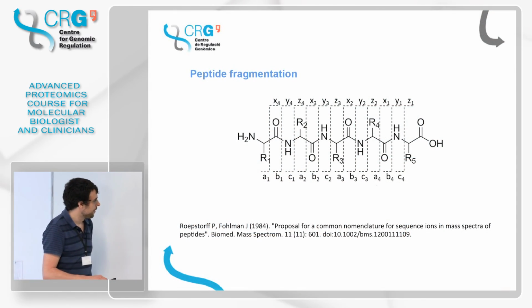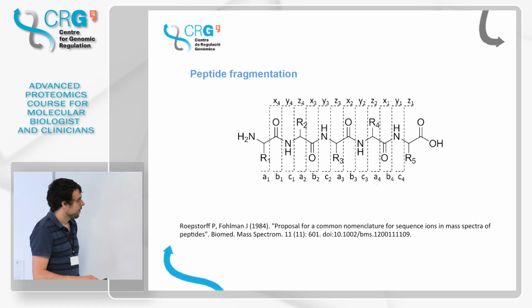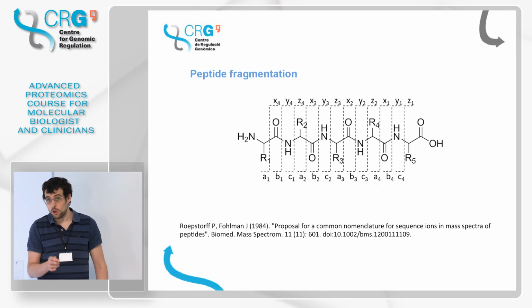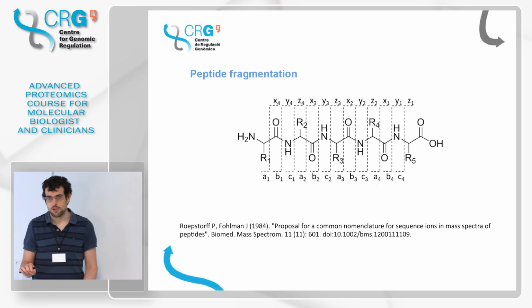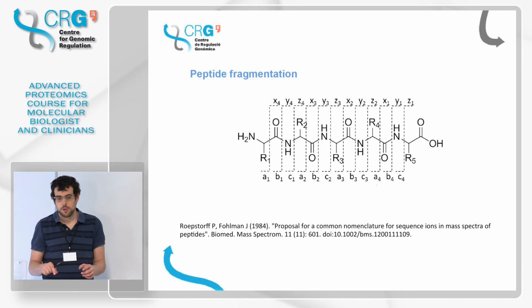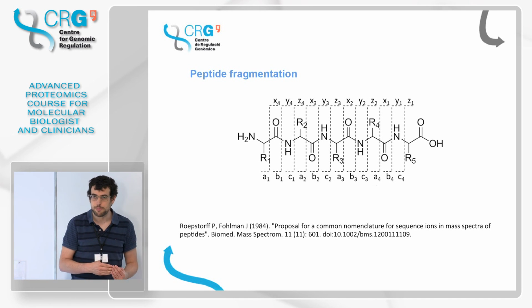So it can be anywhere within the skeleton. It could also happen that it breaks somewhere else, but actually these fragmentation techniques are quite optimized for peptide analysis.